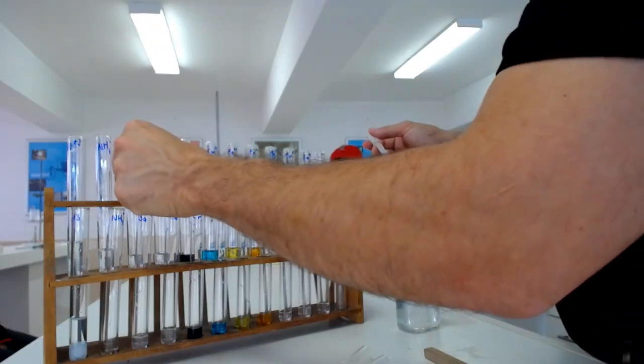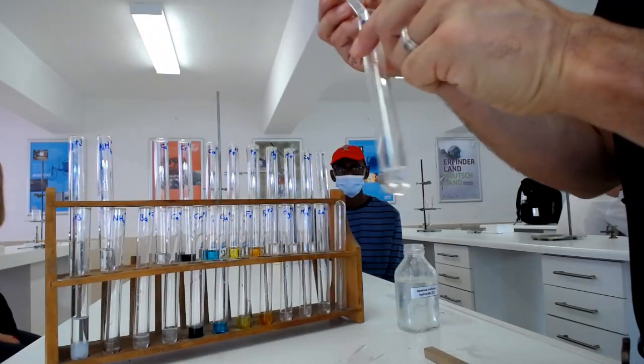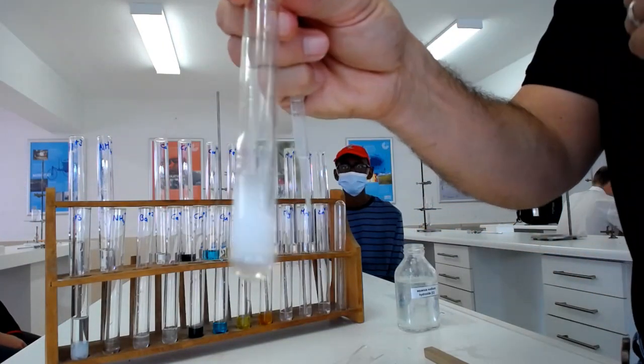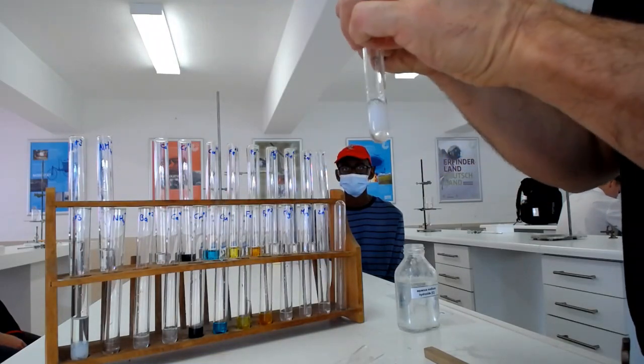Okay, so barium. What happens to barium if I add a bit of sodium hydroxide? Oh, a nice white precipitate. There it is again. What happens if I added an excess?